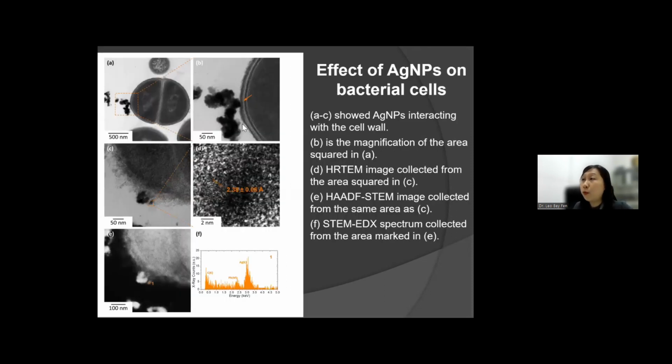If we are interested in nanoparticles, we can even see the individual nanoparticles. For example, this is silver, or it has already oxidized to silver oxide. All of these can also be imaged under the TEM. With the TEM provided with an EDX, we can do elemental analysis. And this is an image from a high angle dark field STEM, a dark field, so we can see how they interact with a bacterial cell.